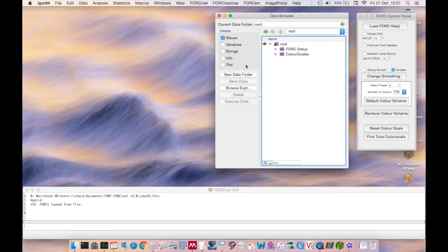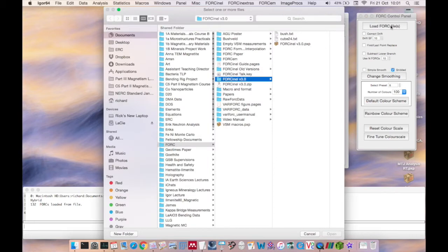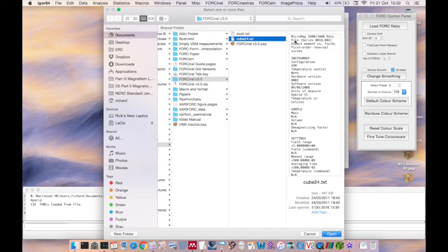OK, let's get started. We'll load in a Fork file. For this demonstration I'll be using the cube24.txt fork data file, which can be found in the ForkNL download package.